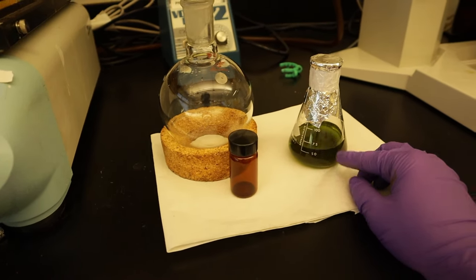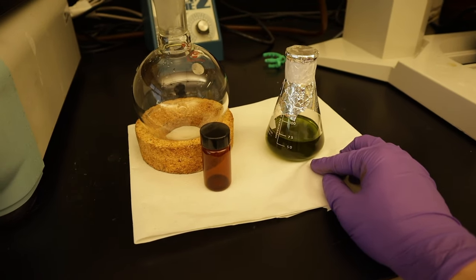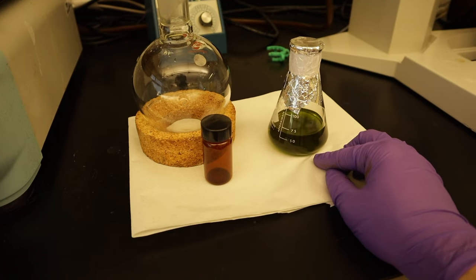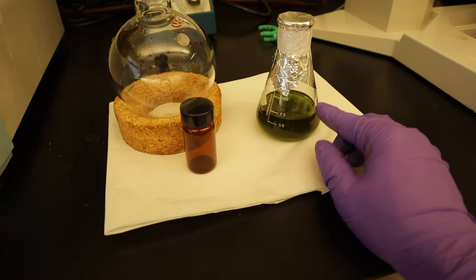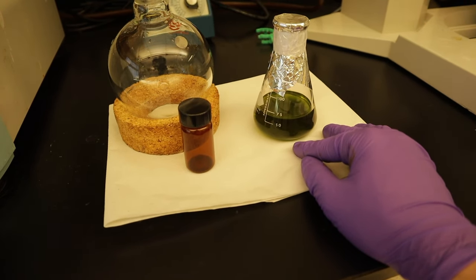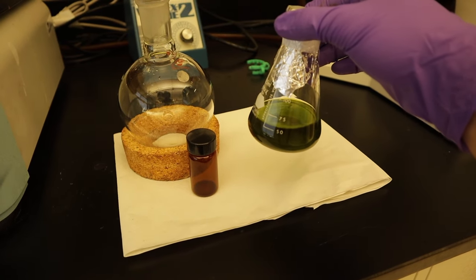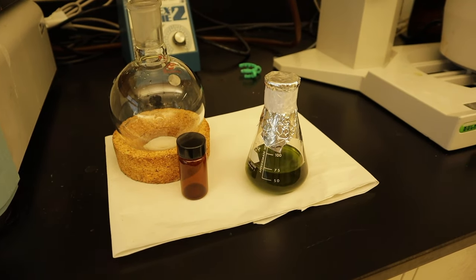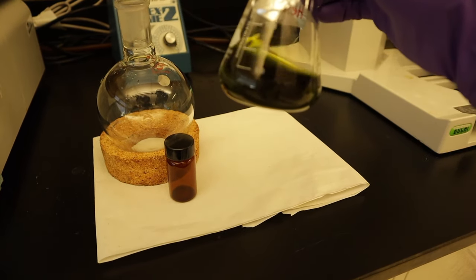We put the plant material, which is the leaves of Corchorus olitorius. In Filipino, it is called Saluyot. We soak the Saluyot leaves in a solvent for three days. Then, after three days, we filtered it to remove the plant material or the leaves, leaving us this solution.